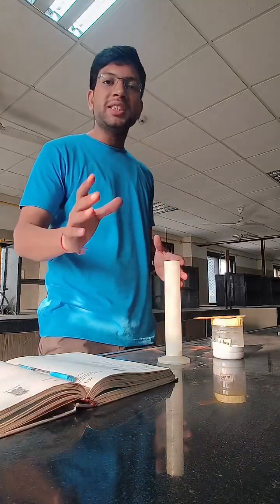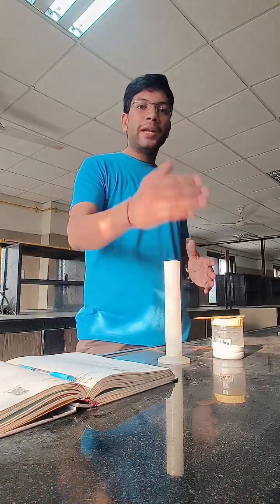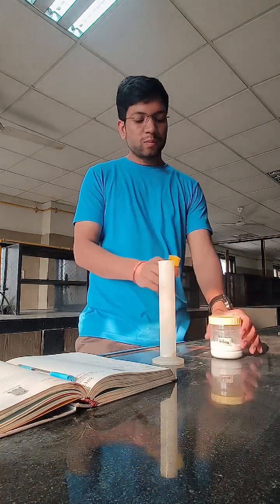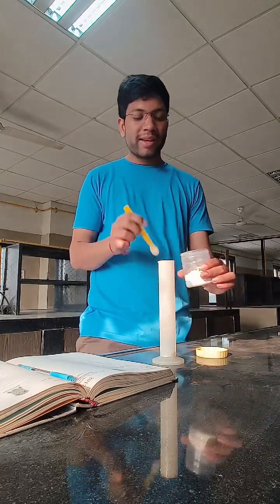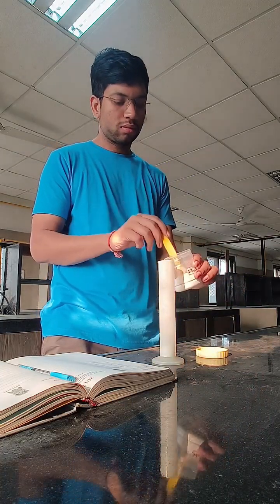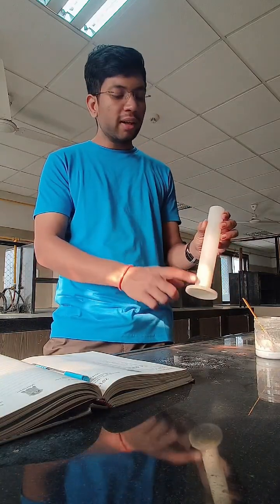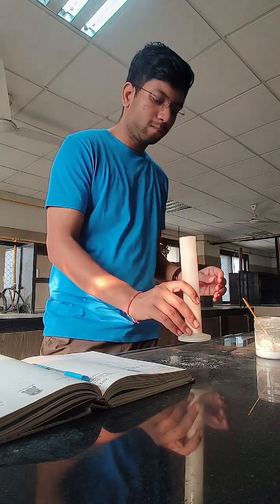After making the observation table of number of tappings versus volume for the brick powder, now we will do a similar experiment for the silica powder. First, we will pour 30 ml of silica powder into the measuring cylinder. After filling it up to the 30 ml mark, we have measured the weight of the cylinder with powder in it. Now we will start the tappings.